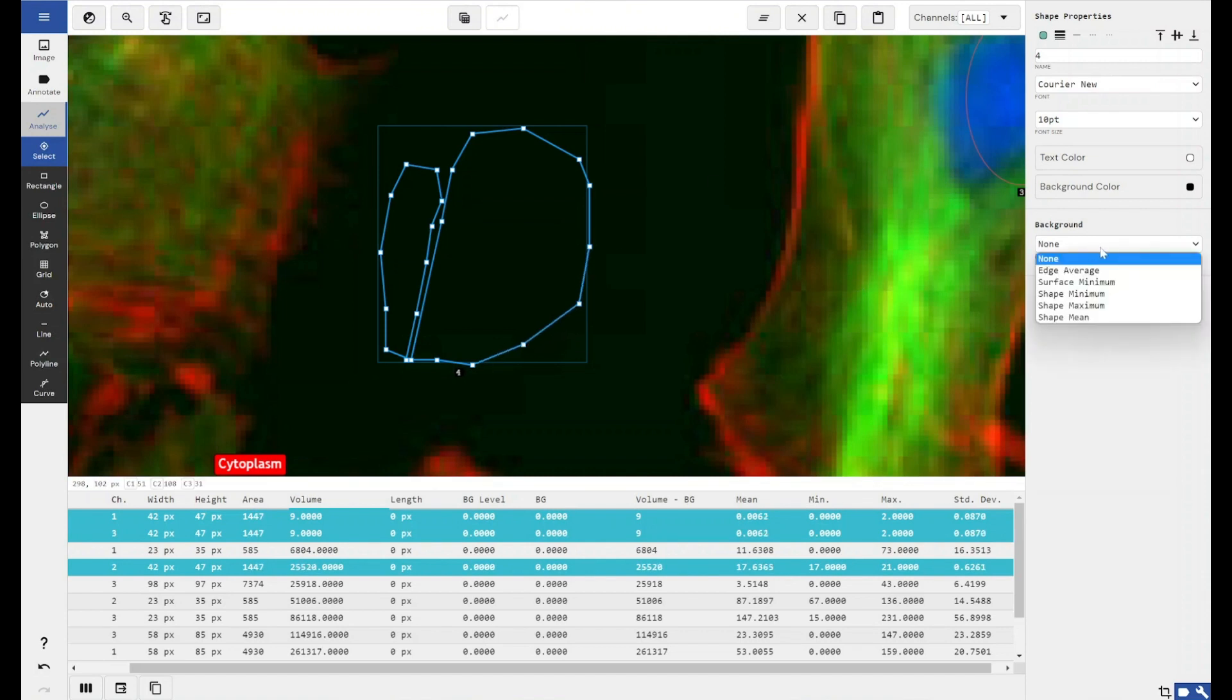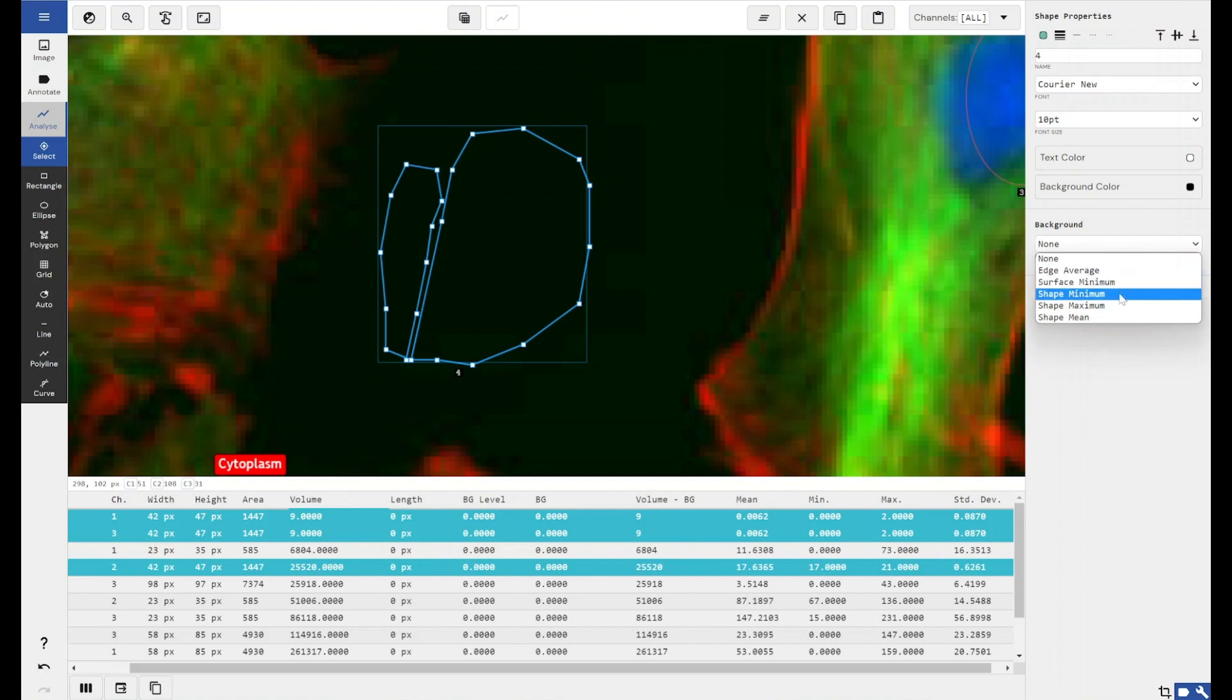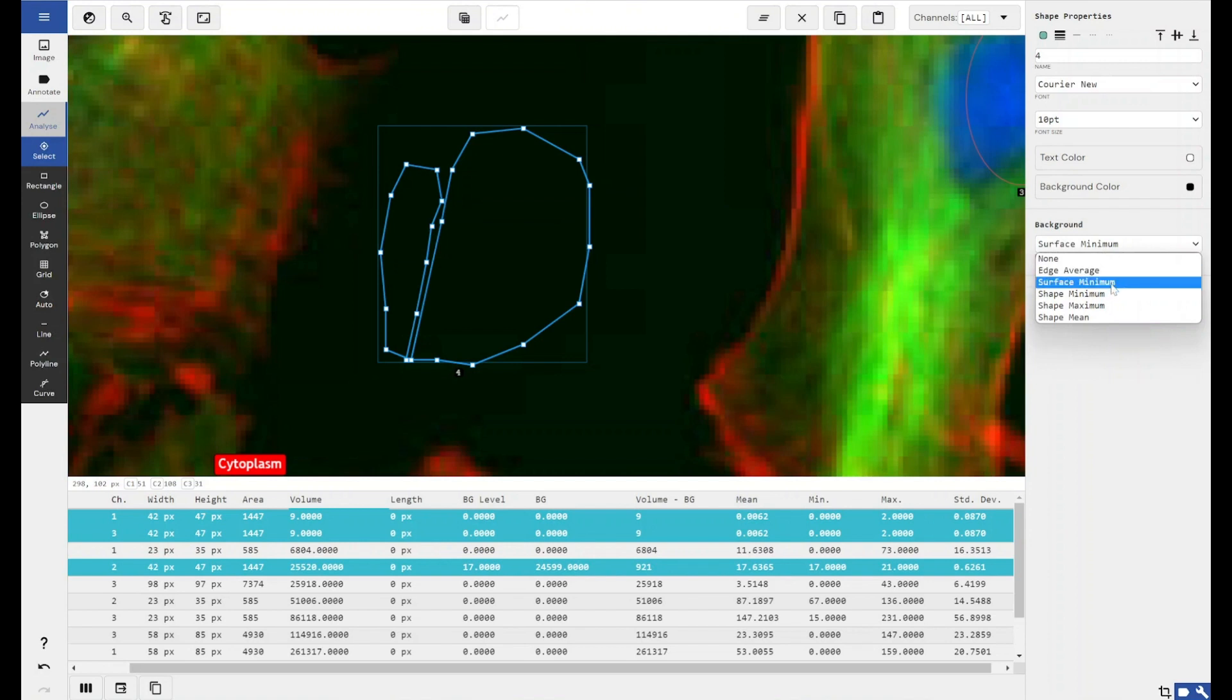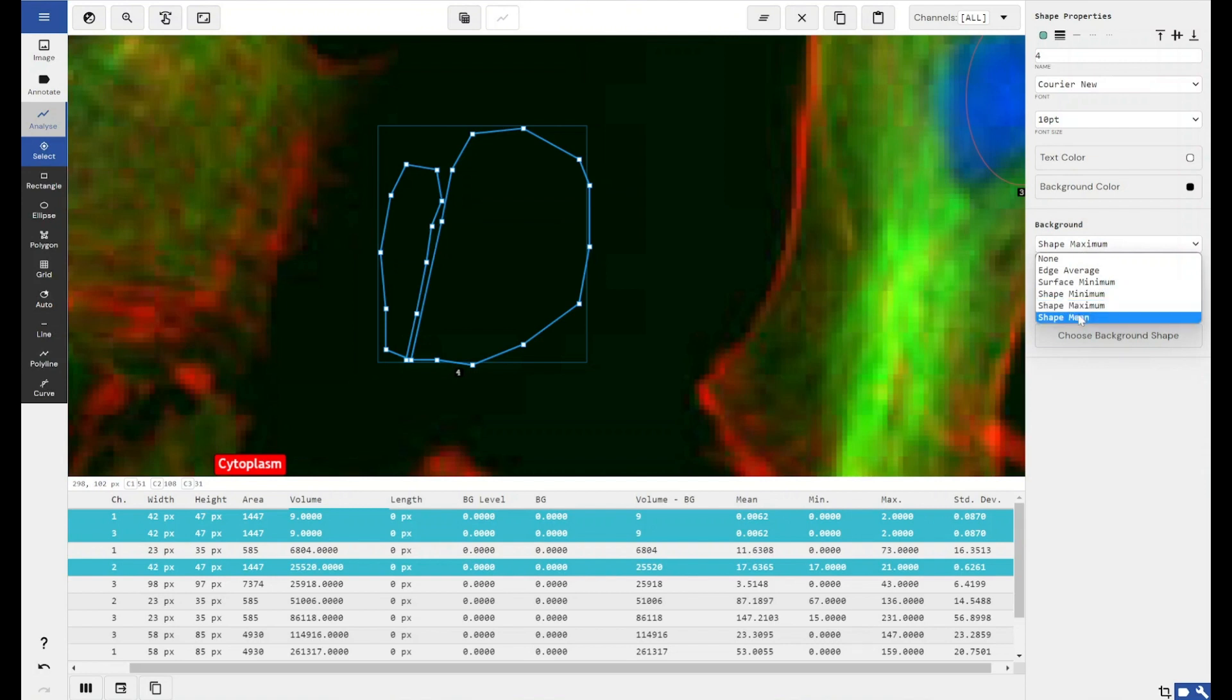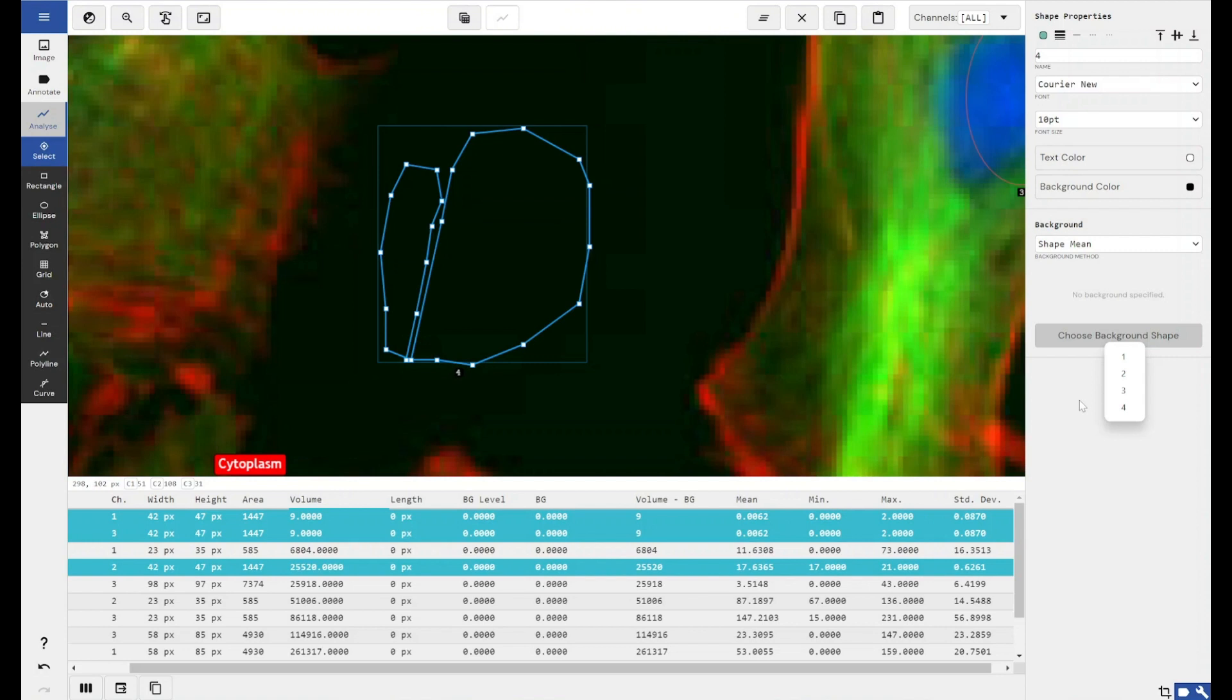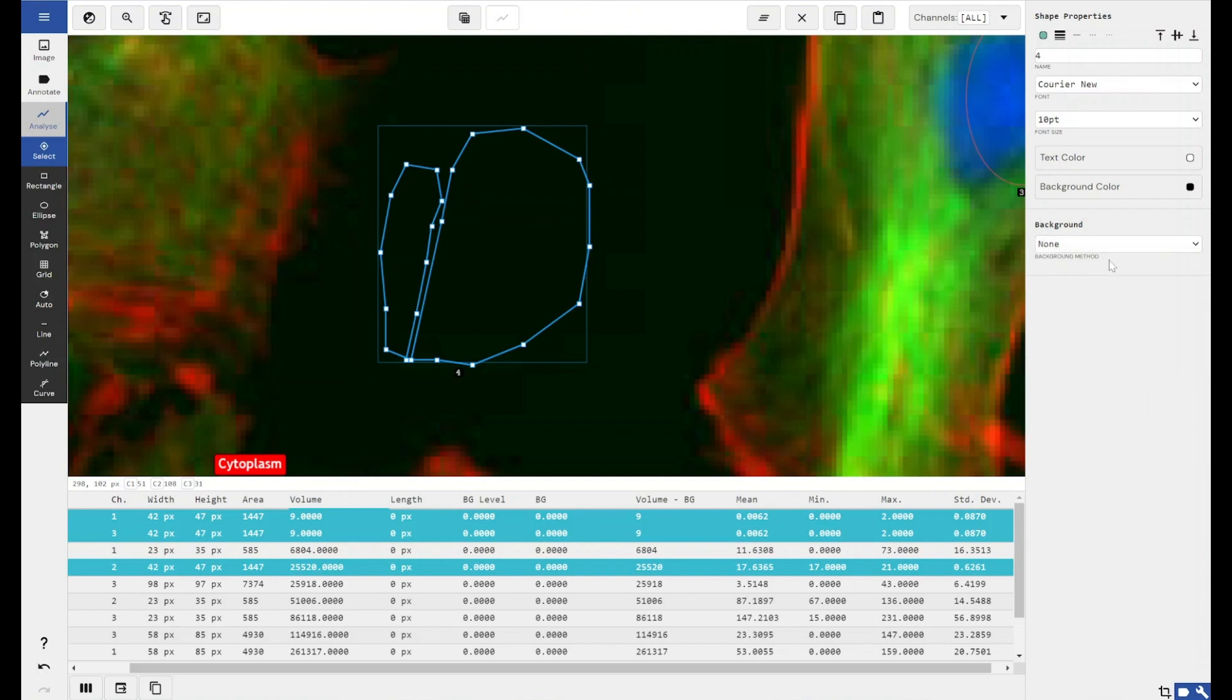We've also got the option to perform background removal on any of the shapes that you've drawn. You can use an average of the pixel intensity around the edge of the shape. You can use surface minimum, so set the edges as the minimum background removal value. If you use shape minimum or shape maximum, the software will allow you to choose another shape to take the background value from for background subtraction. And shape mean, again, allows you to define another shape within your analysis, use the mean value of the intensity of the pixels within that shape, and use that as the background subtraction method.